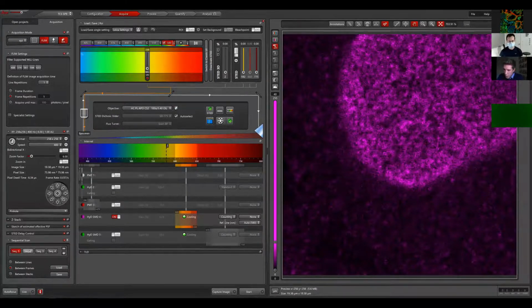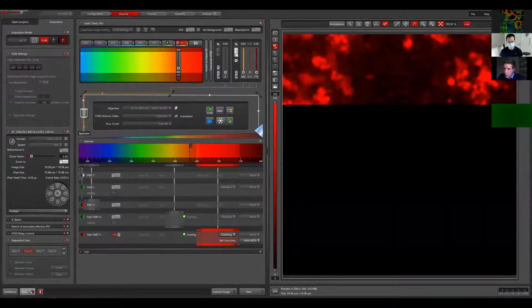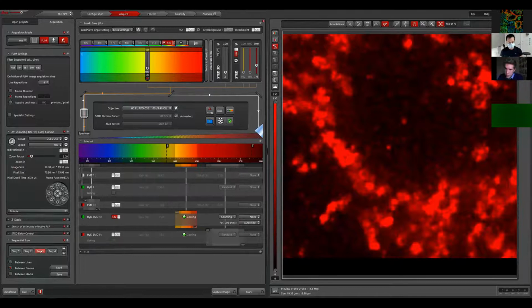So there's one question from Jessica about the Navigator. I think this is the first one. So I'll just start at the top here. Jessica is asking if in the Navigator there is an option to move the stage to a different region. Yes, you can do that. You can deselect the option to take an image when you double click somewhere else on the stage. I'll leave it at that. If you have more questions, please contact me later about that.